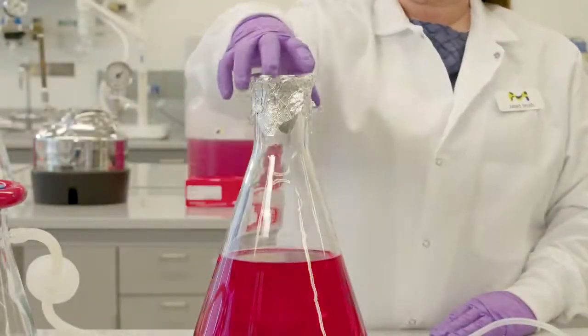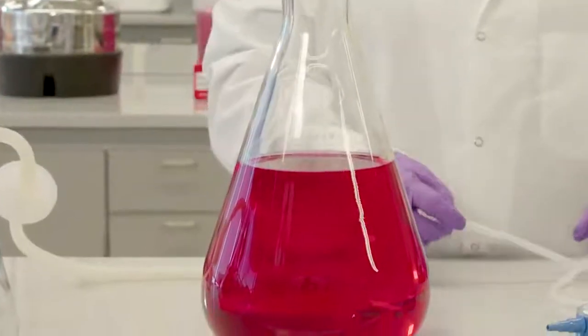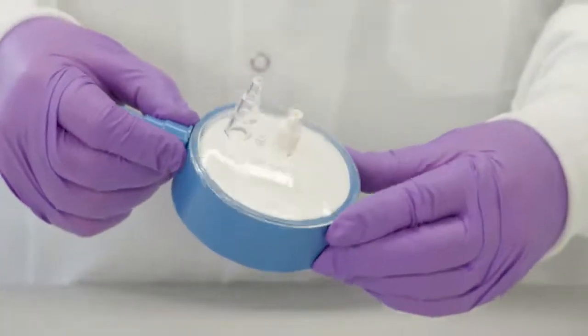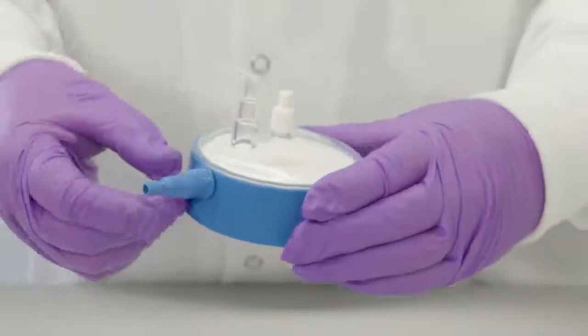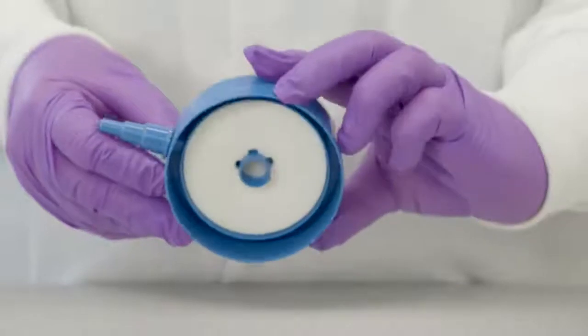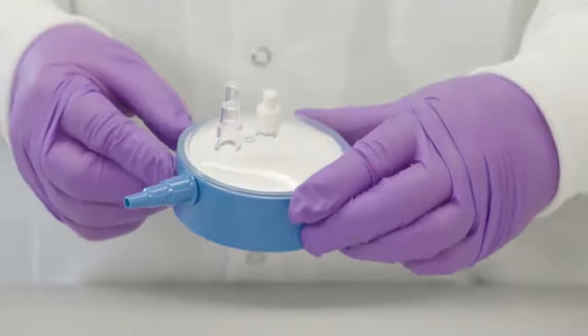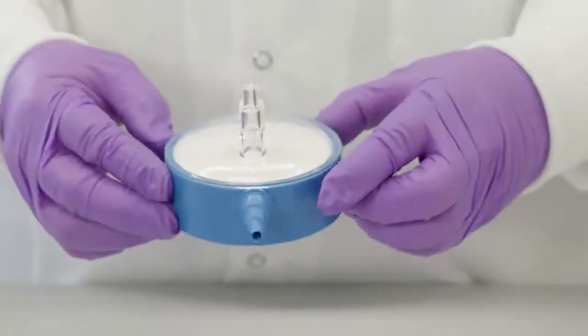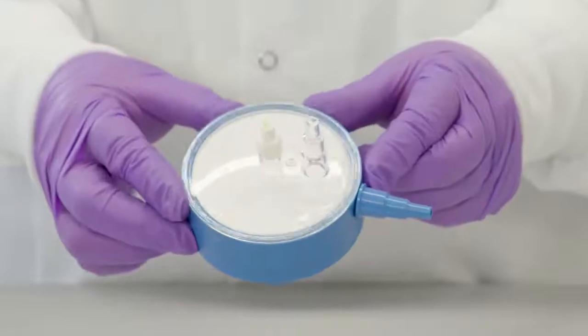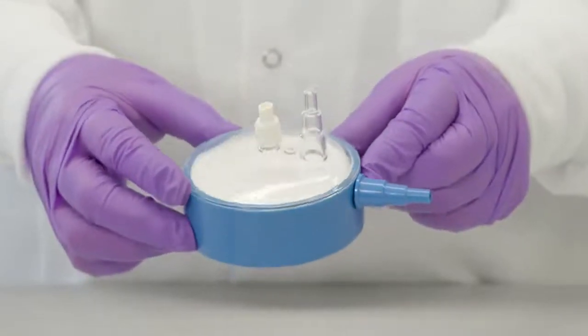First, set up the reservoir with your solution to be filtered using the SteriCap Plus bottle top filter. Alternatively, a peristaltic pump could be used. This filter device can be used to filter most aqueous solutions and medias, but check the user manual for chemical compatibility. Always follow usage and safety precautions and guidelines when using the system with vacuum pressure. Today we will be filtering a simulated tissue culture media.